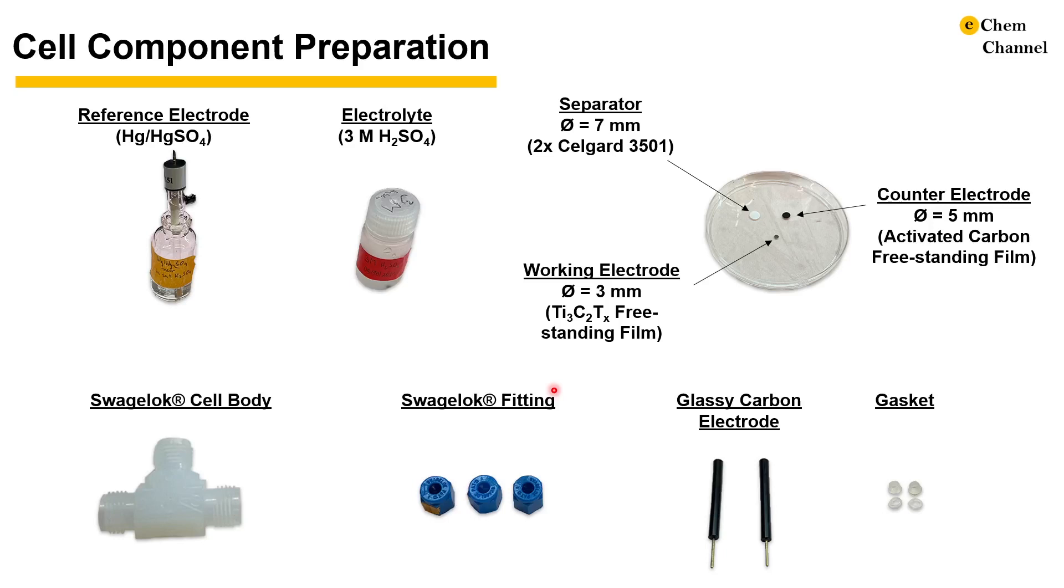The activated carbon freestanding film is made of 95 weight percent YP50 activated carbon with 5 weight percent PTFE. The Ti3C2 maxine film was prepared by vacuum assisted filtration.